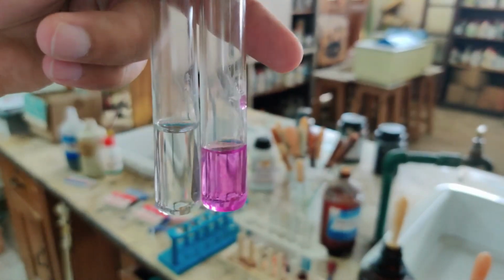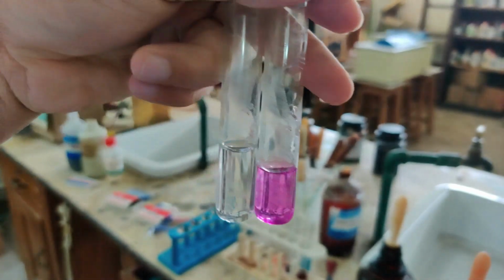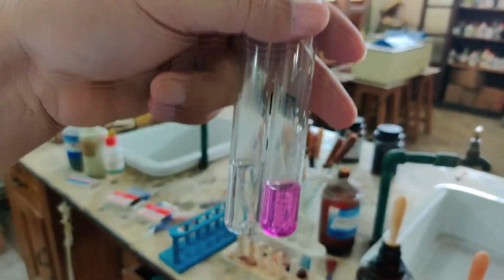So there you are. Phenolphthalein will turn pink when you are using a base. Phenolphthalein turns pink in a basic solution.